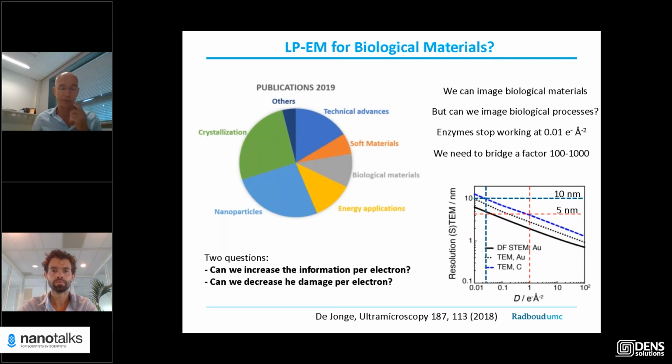In cryo-electron microscopy, when damage is done, damage is done. There's no way back.